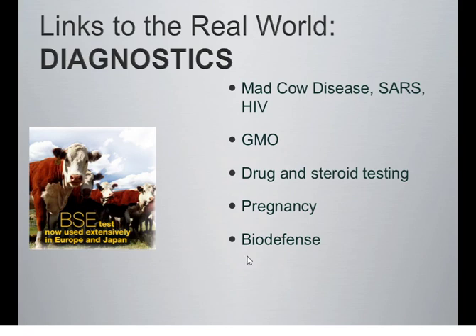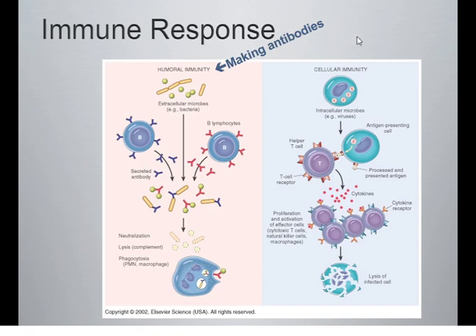And that's one of the difficult things, especially today with this outbreak, is we use PCR to determine whether or not people are positive rather than an ELISA. Now, let me explain how an ELISA essentially is made. And you'll begin to see why we haven't quite used it yet and ultimately how hard it is to generate some of the reagents for this test, as quick as it is.